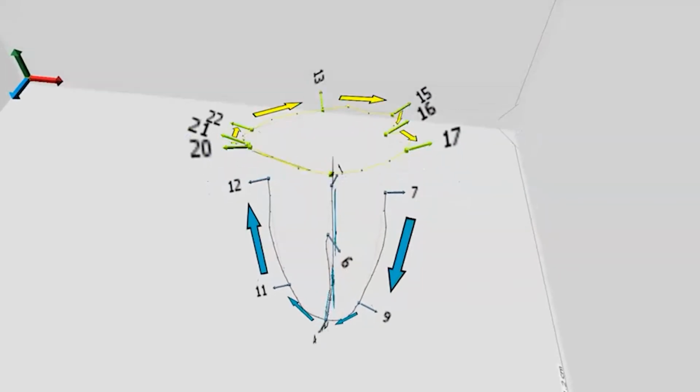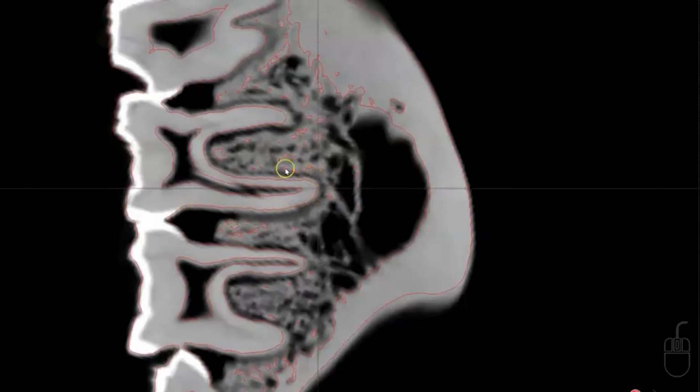were extremely time-consuming. First, we would extract an isosurface from a CT scan in Checkpoint. That isosurface would have most of the mandibular bone around the roots removed, but not all of it, because if we removed all of it, the tooth roots would also go away. We would then open that isosurface in GeoMagic and very carefully remove every bit of mandibular bone around the tooth roots. That obviously took a long time.